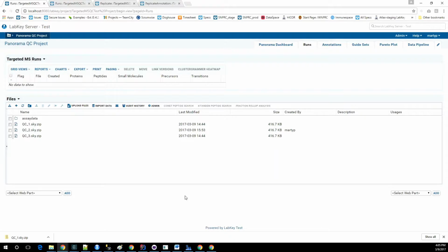The second problem was that if there was an instrument setting change and it affected a previously uploaded sample, since we didn't want to upload duplicate data, the new sample data for a previous sample would not be updated when that upload occurred.